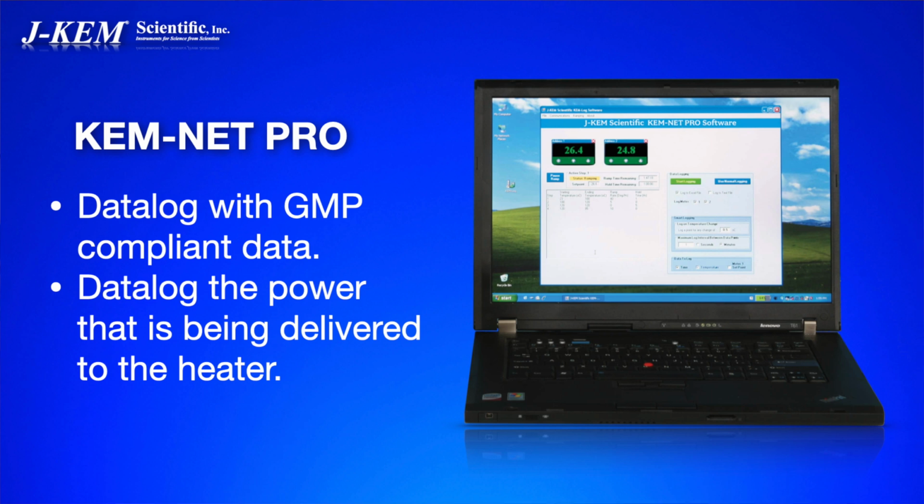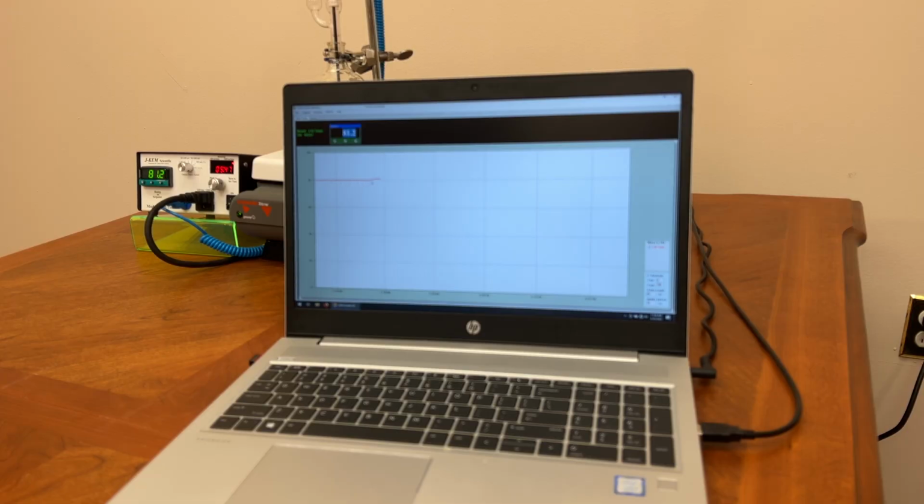And the important thing about being able to monitor the power being sent to the heater is you can imagine, in this run right here, what if there was just a very mild exotherm? In most cases, you would completely miss it because the temperature controller would see that there is a small increase in temperature and it would do exactly what controllers are supposed to do. It would cut its power to that heater. It would turn off its power to that heater so that it doesn't overshoot the requested temperature, 80 degrees.